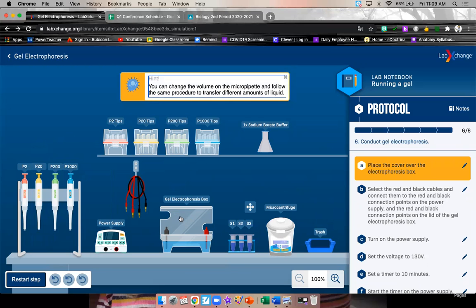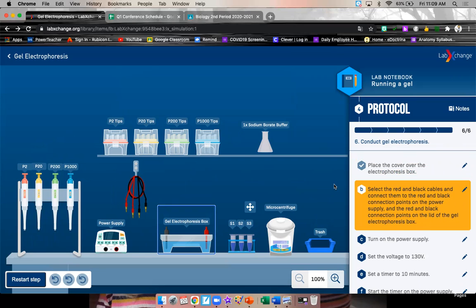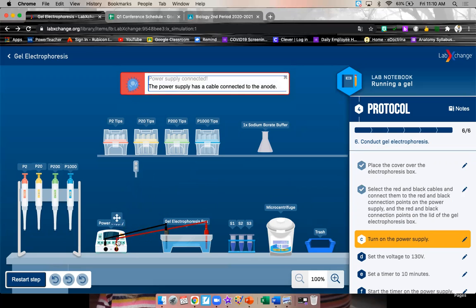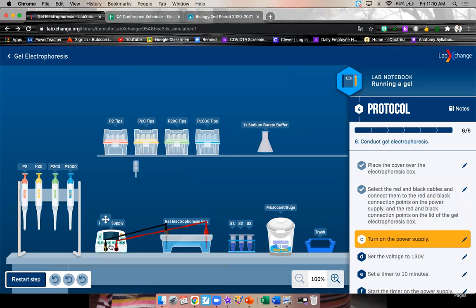Place the cover over the box and select the red and black cables and connect the red and black connection points on the power supply and the red and black connection points on the gel electrophoresis box. Grab this red one and put it in this red slot and I'll put it in this red slot. Grab the black one, put it in this black slot and I'll put it in this black slot.